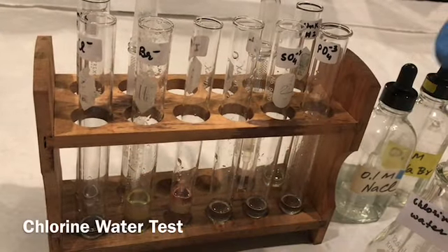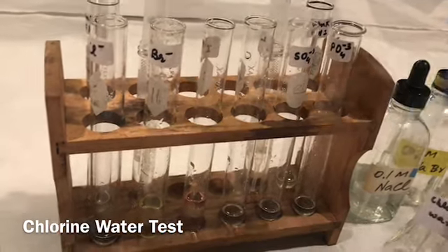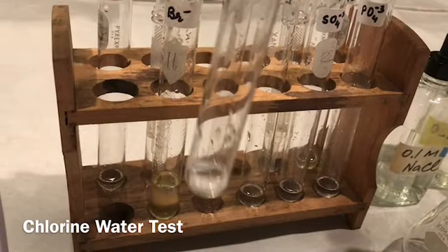Okay, so now these are the observations after adding the chlorine water for all the 8 test tubes. This is the chloride ion.